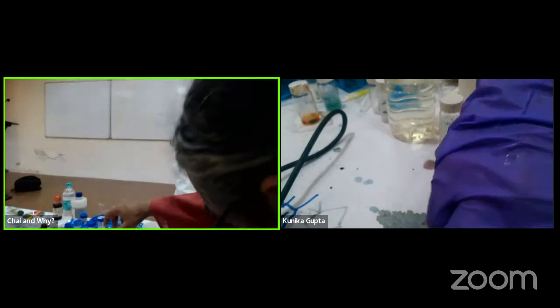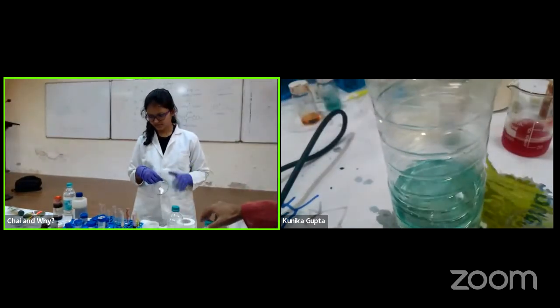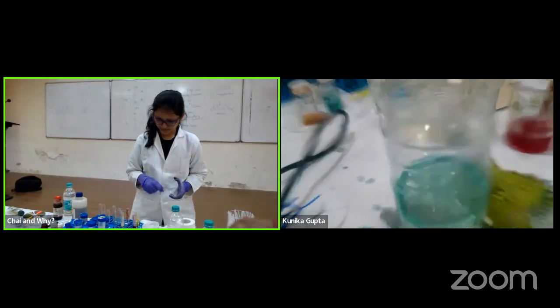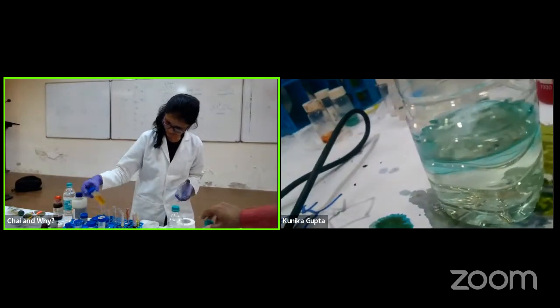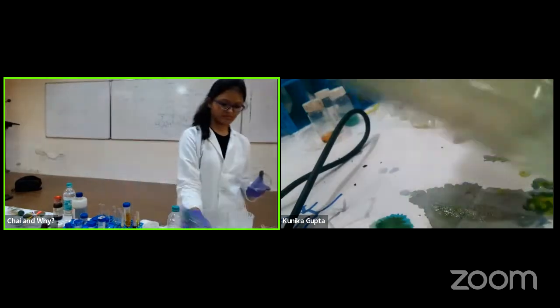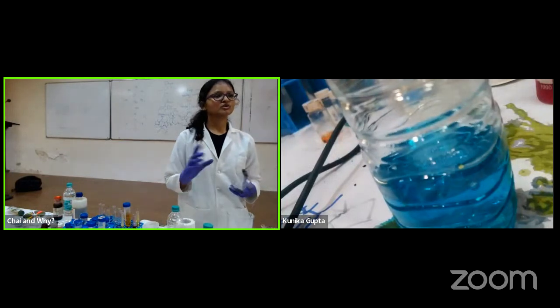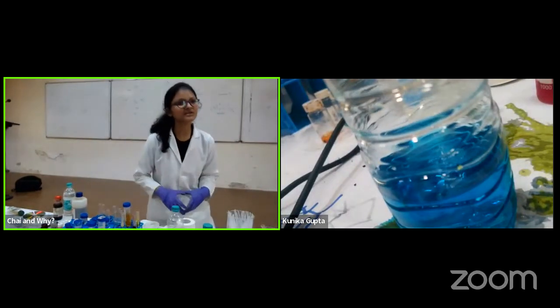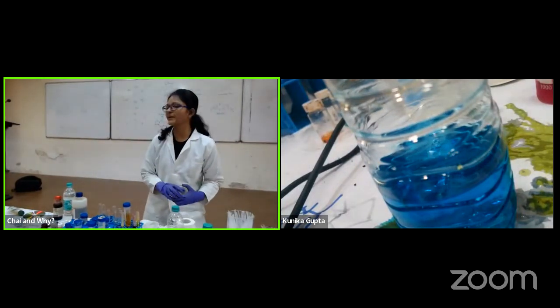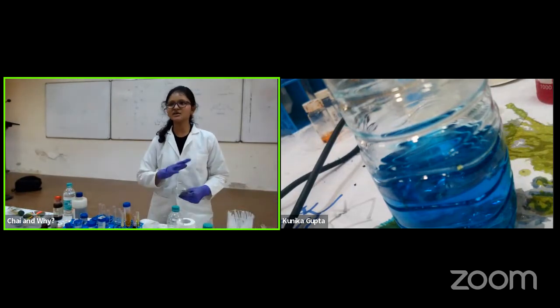Okay, so our original blue bottle has also become very light. Okay, this has become very light, and now will you shake this once? Shake it, and it became blue again. So that's exactly my point: these reactions are actually dependent on the amount of oxygen, because it's redox chemistry happening.